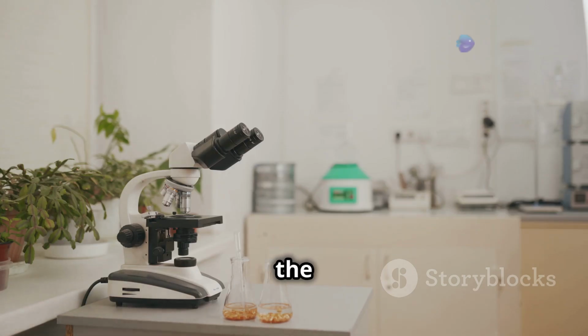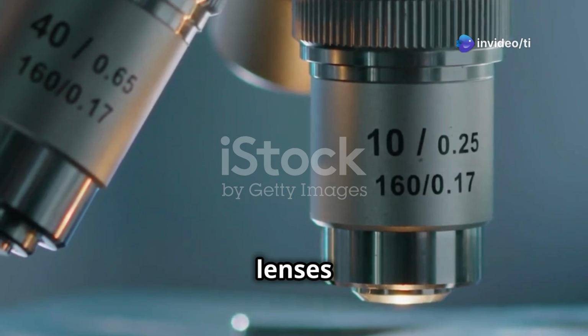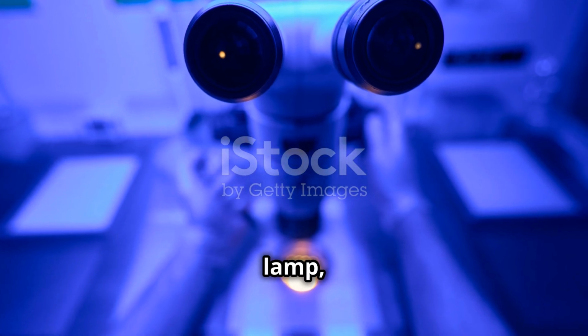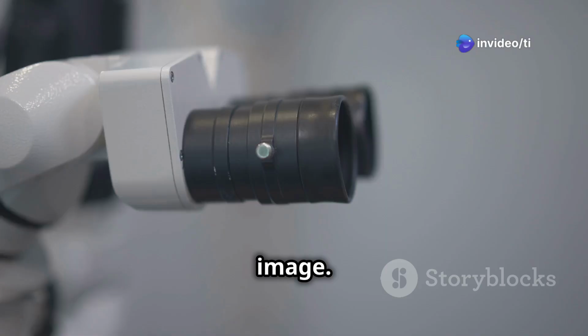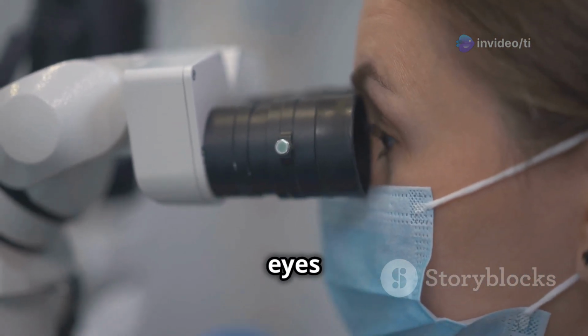Our journey begins with the most common type of microscope, the light microscope. These marvels of optics use visible light and a system of lenses to magnify objects. Light from a source, often a built-in lamp, passes through a thin specimen. The light then passes through the objective lens, which magnifies the image. Finally, the light reaches the eyepiece, further magnifying the image for our eyes to see.